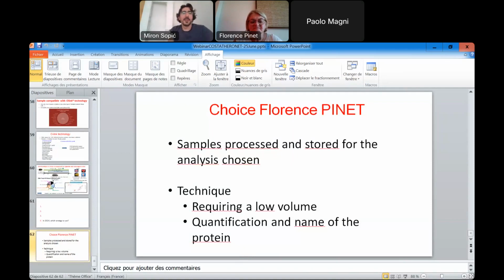Thank you so much for this very thorough guideline on how to go through proteomics and also how to choose which solutions are the best depending on the questions and so forth. It was really insightful and quite a comprehensive overview of all these approaches. I was wondering if you can give us a little more information about the prices per sample when you use SomaScan and Olink and so on.